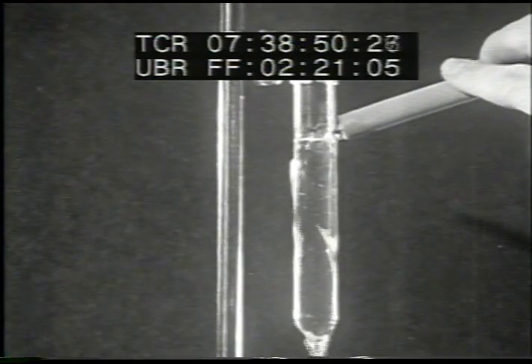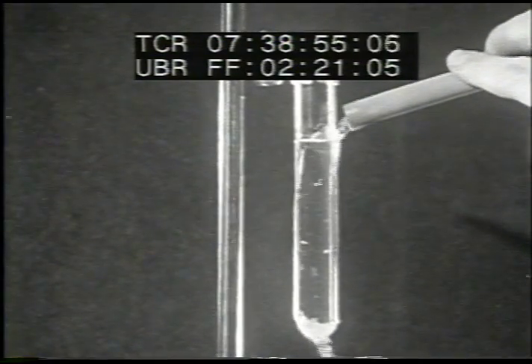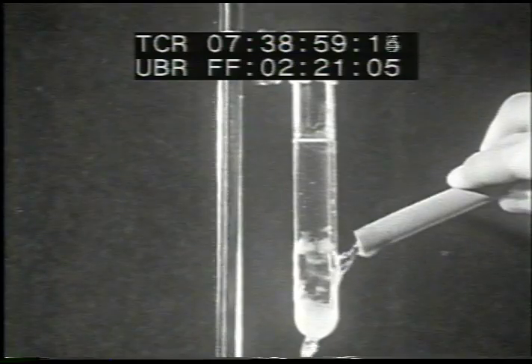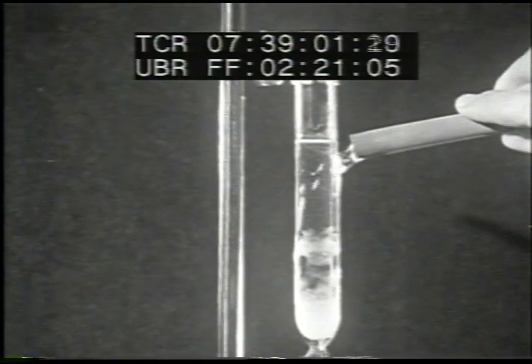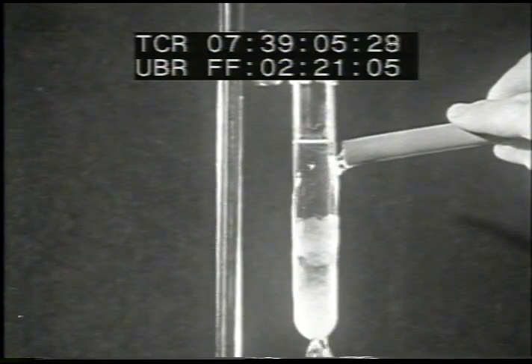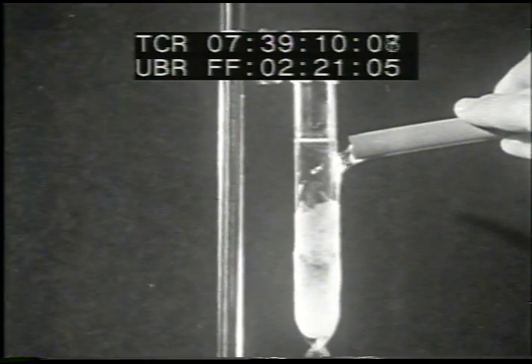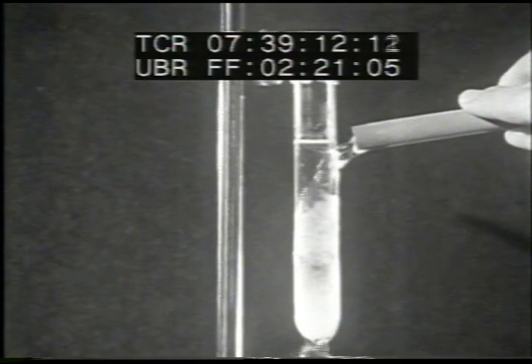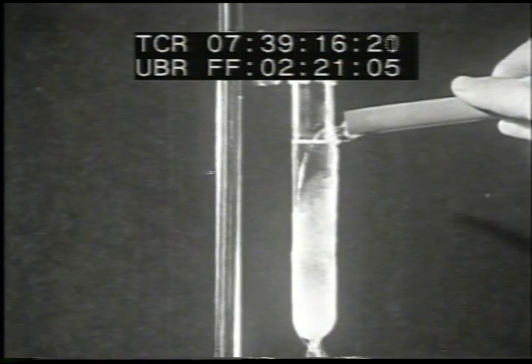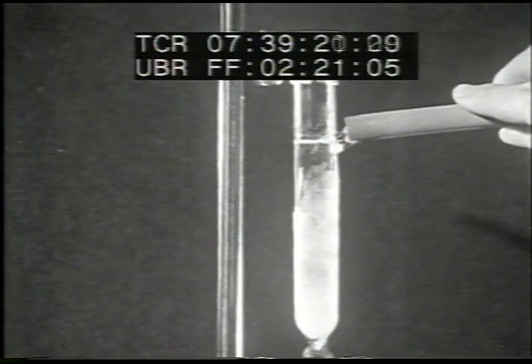Almost all solid materials are more soluble in warm water than in cold. Here is a test tube filled with a concentrated solution of potassium nitrate. The tube is cooled by a stream of running water. The solute crystallizes out of the solution as the temperature is lowered by the water. After the solution becomes saturated, due to the lowering of the temperature, any further cooling causes crystallization. The solvent at the end of the experiment is still saturated.